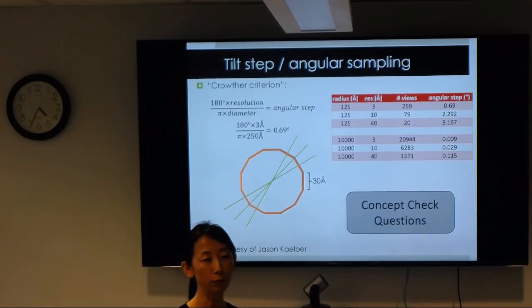So what you have to do is take the grid out, and physically use a tweezer to turn the grid 90 degrees. And you have to load the grid back into the microscope, find exactly the square you imaged, and then do the tilt. During the process, many things could happen.